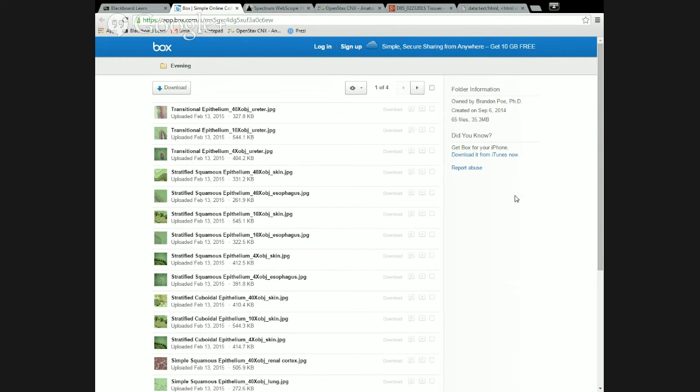So to do that, this scope up here works a lot like the scopes there. I'm going to assign you your tissue, and each of you is going to find it on your scope. I want you to show me that you found it on your scope, which will help me understand if you need help using scopes, and hopefully we'll get to the point where everybody can use a scope. And then when I've seen your tissue and I'm satisfied that you're using the scope fine, you're going to come up here and capture that tissue with this microscope. And then we'll save it and it'll be on Blackboard there for everybody to look at.